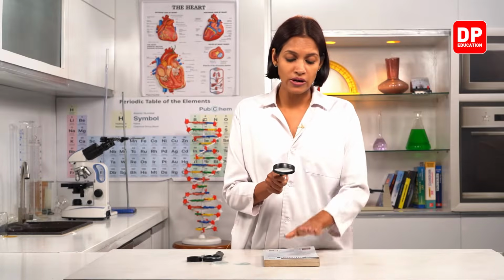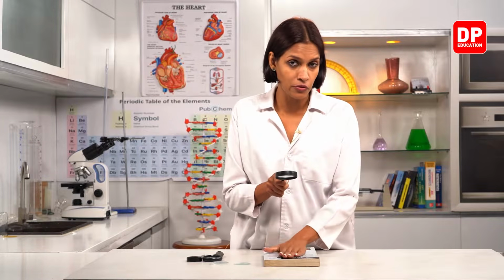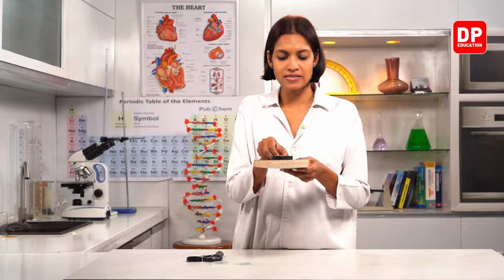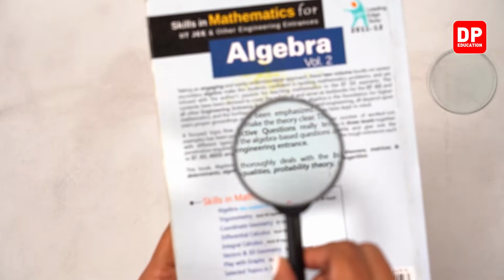You are going to change only the distance between the book and the hand lens, the object and the hand lens, okay? Now, first of all, I am going to keep this book very close to the hand lens. Can you see a difference, children? No, it looks the same size. Now I am going to take this book a little by little away from the hand lens. Check what happens this time. You all can see this time the letters are magnified, bigger than before. Right, now at this point, you can see maximally magnified letters.